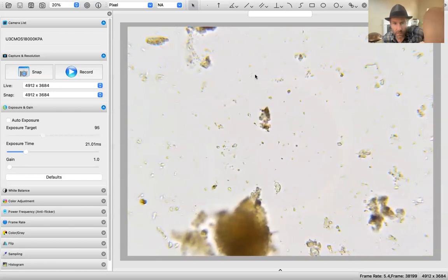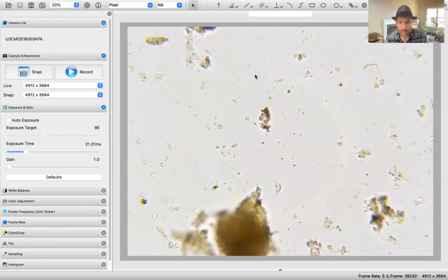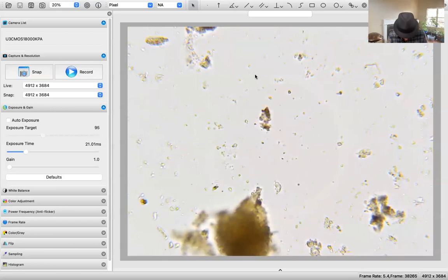I'm going to call that a 0.075, I believe. I think that'll do it justice. And let's move on to our last field of view.